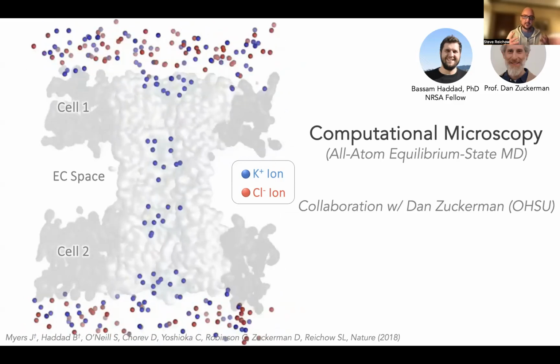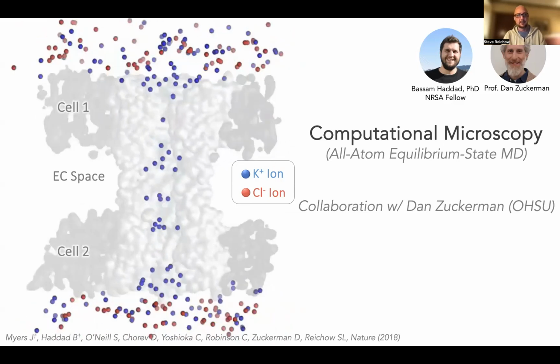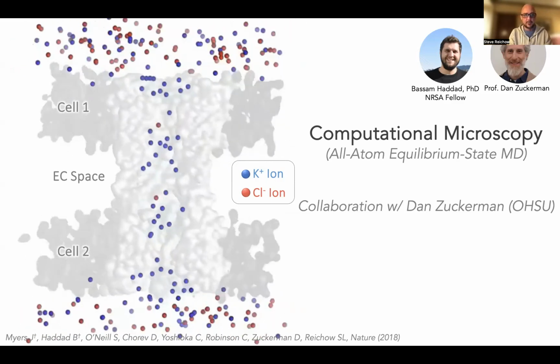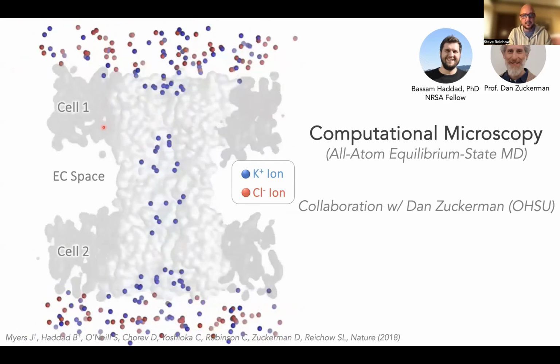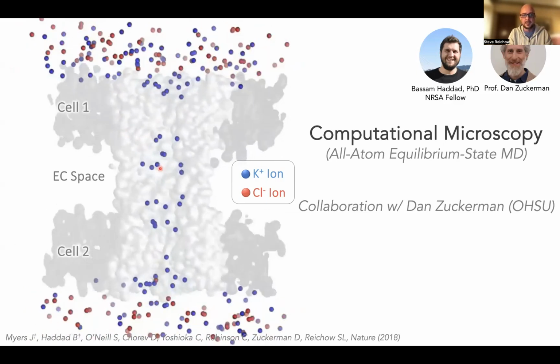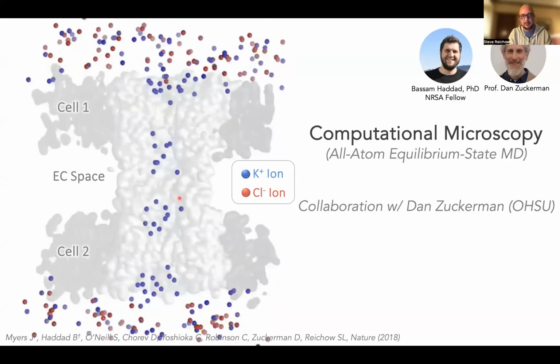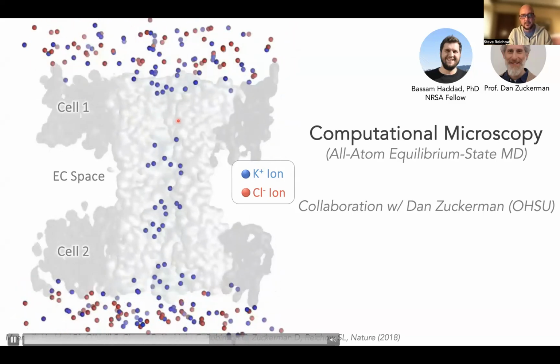And so these MD simulations are extremely information rich, and I could really give an entire talk about all the different things that we observe in these simulations. But I'll just point out a few interesting things and explain how we interpret some of this data. One of the things you'll notice is that these ions, once they're in the pore, don't spend the same amount of time in different regions of the channel. In some regions, they seem to bind to transient binding sites and spend a significant amount of time, while in other regions of the channel, like up here, the ions really spend very little time.